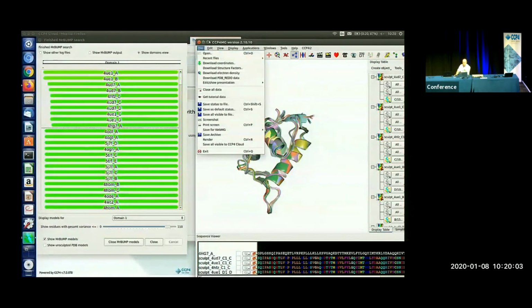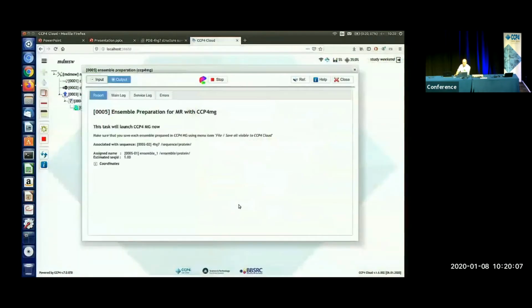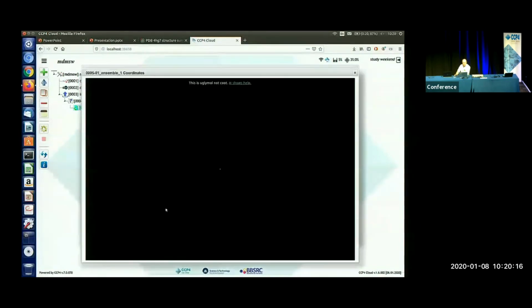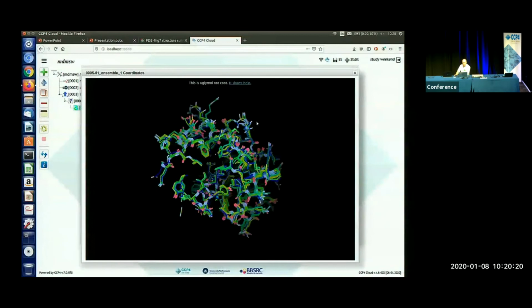And then I can exit this task. Because I ran it locally, it uploads the model to the cloud, and it's now saved. And I can use an application like this Uglymol browser to just see what I've actually saved, and that looks good.